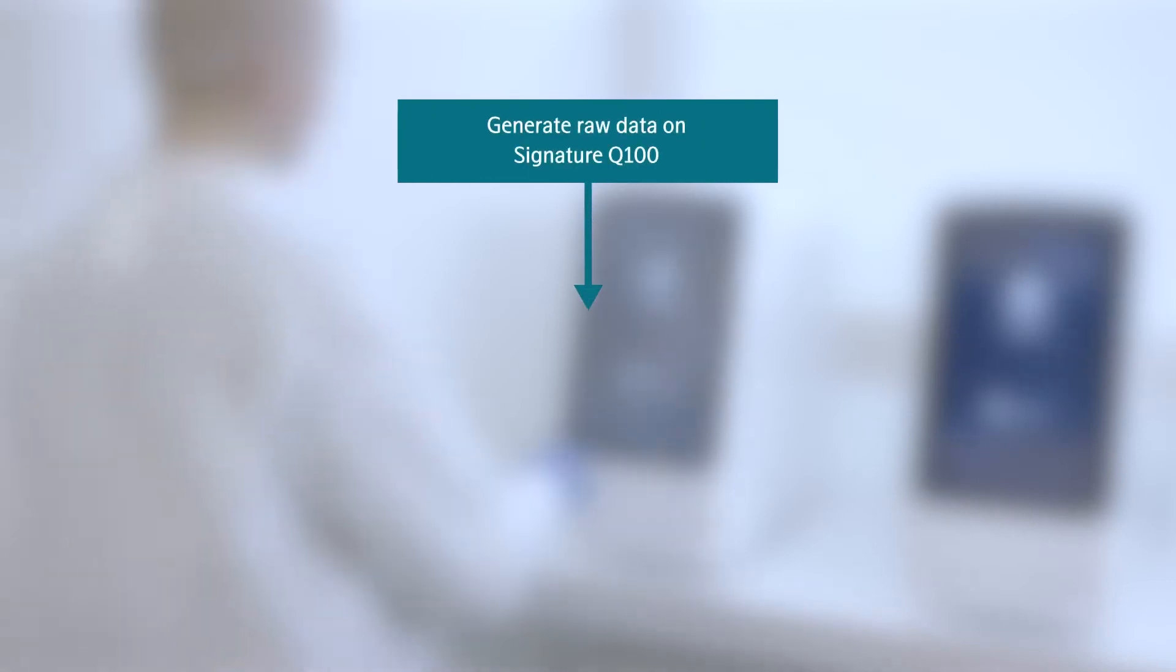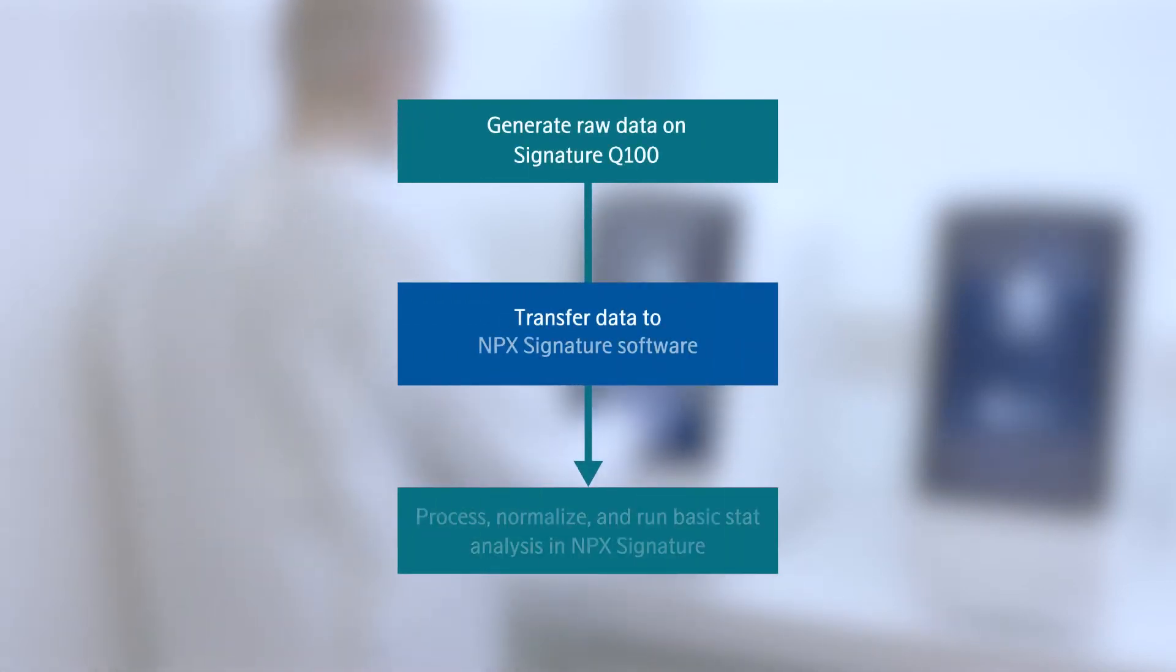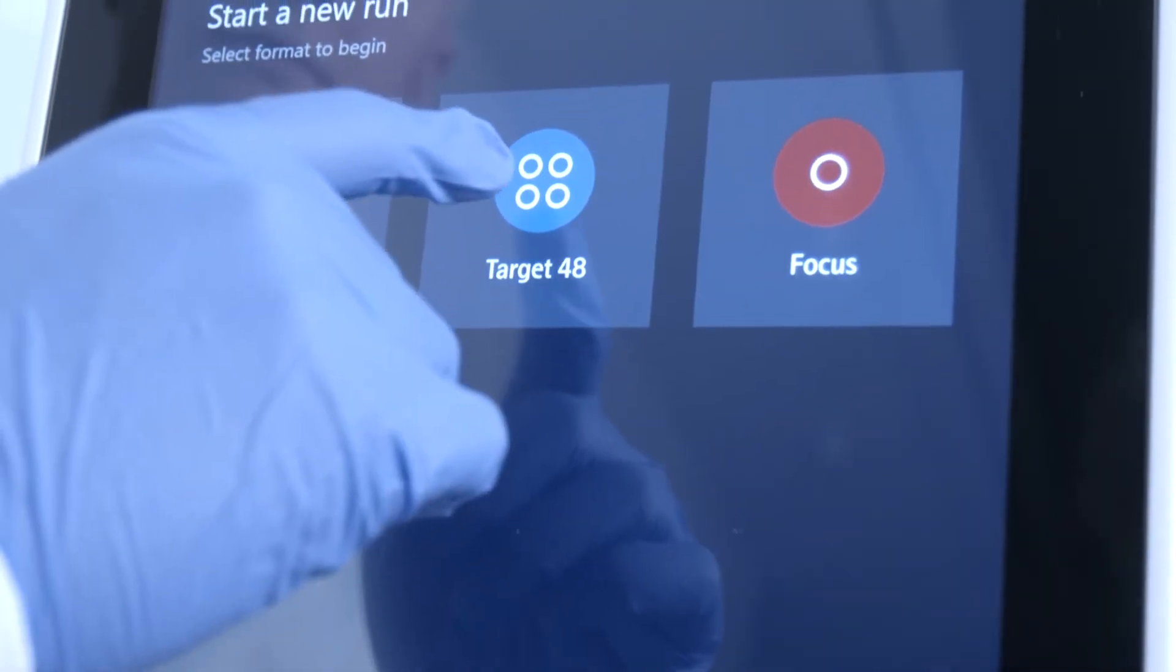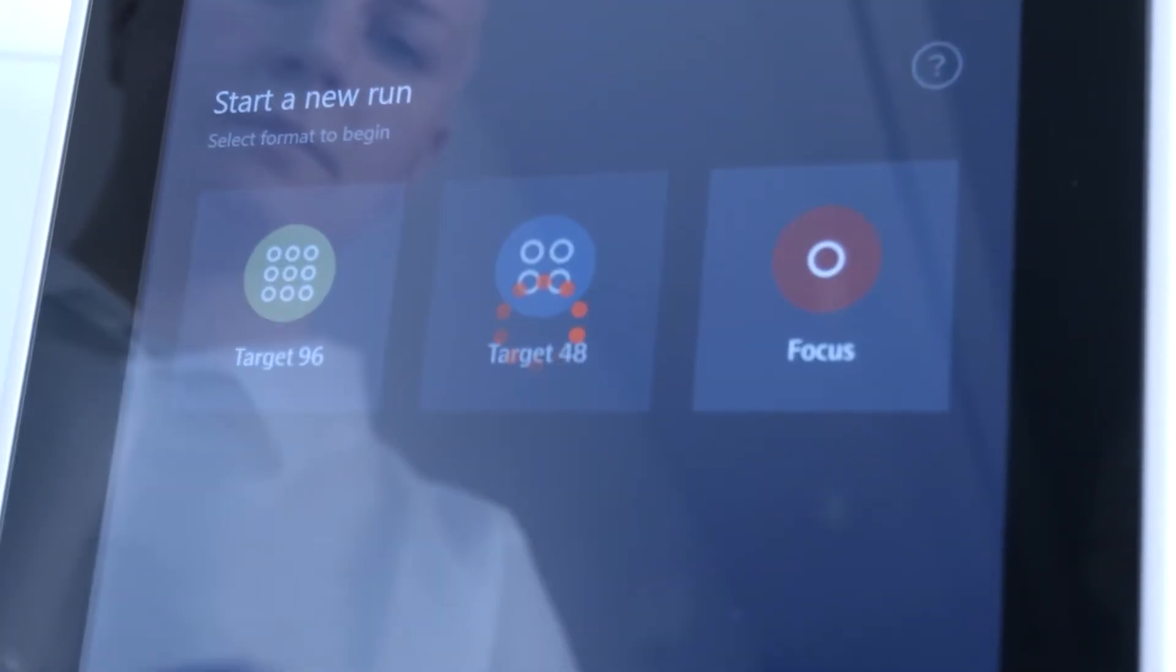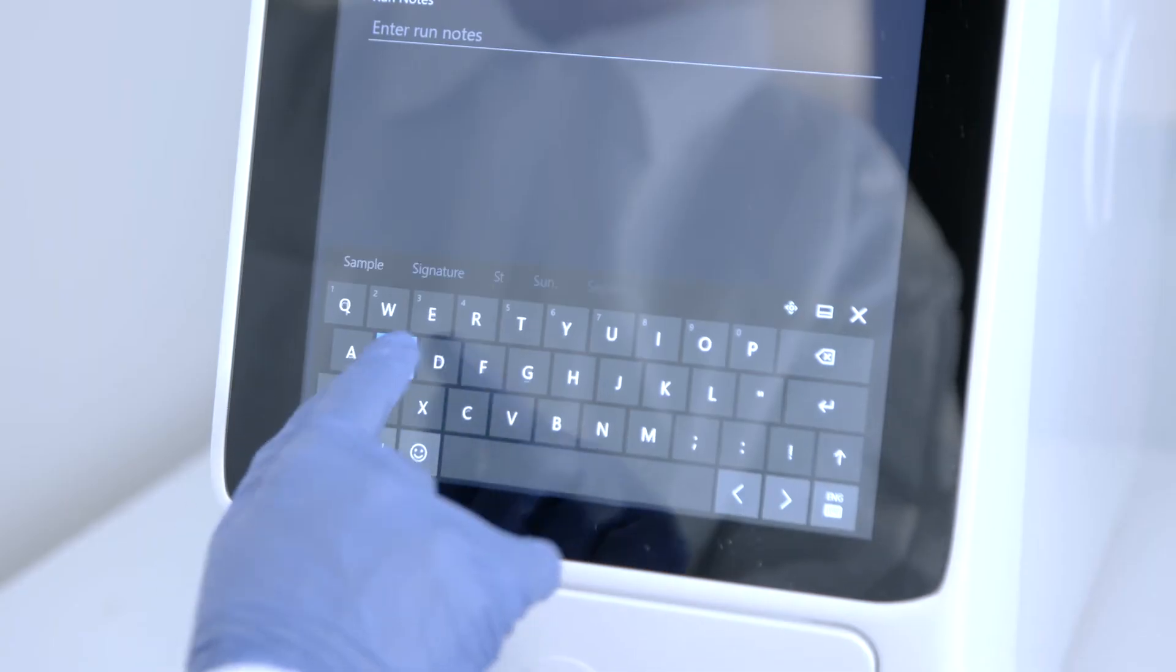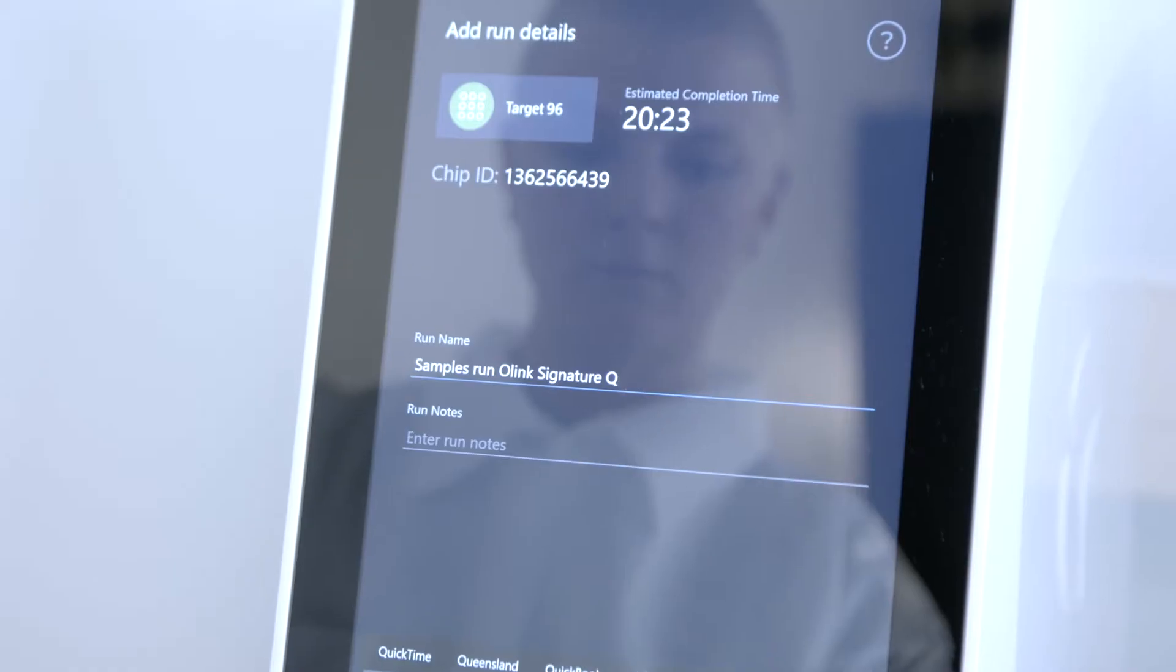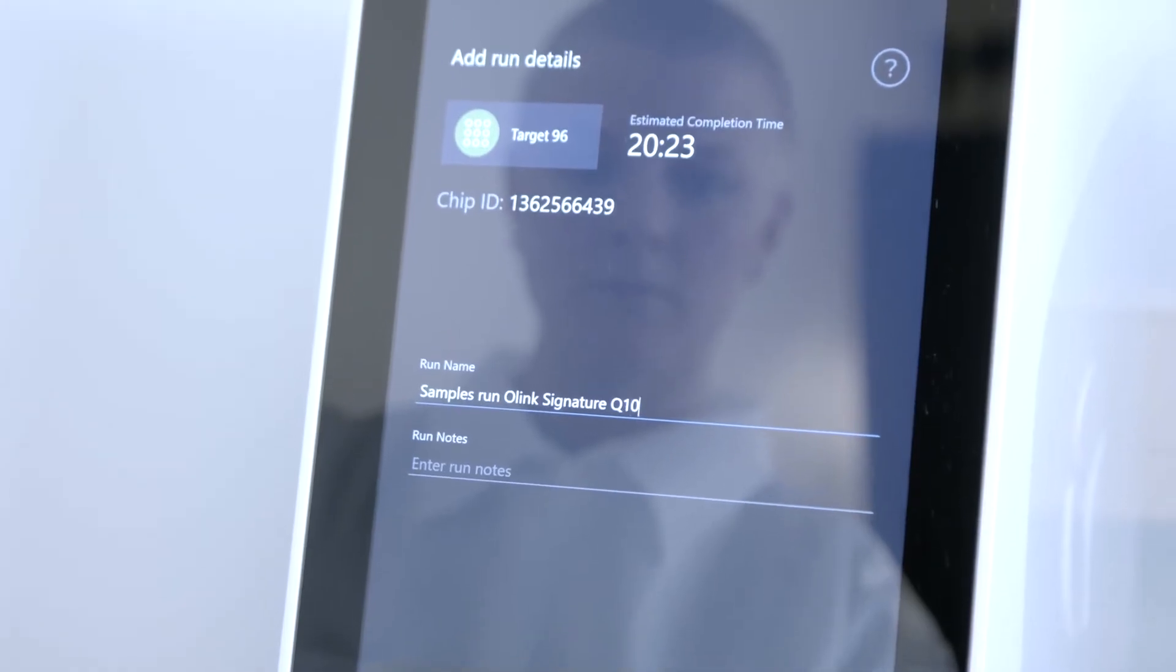Everything about O-Link Signature is streamlined, from form to function. Move seamlessly from sample analysis to data generation using the Signature's user-friendly smart touch screen.